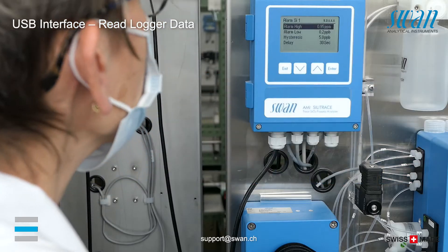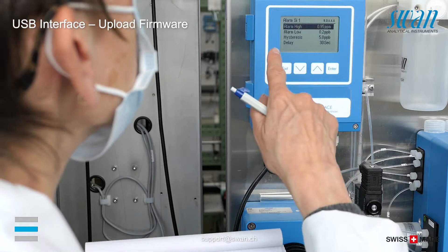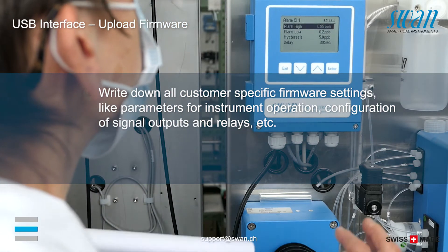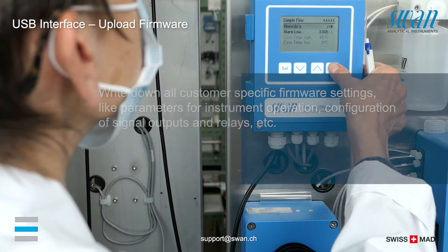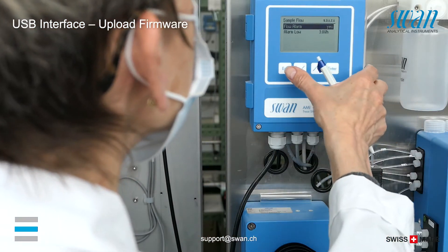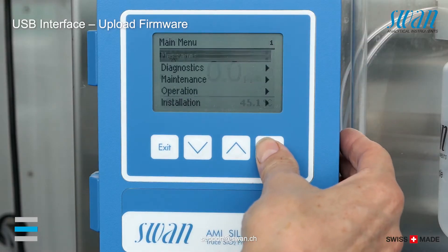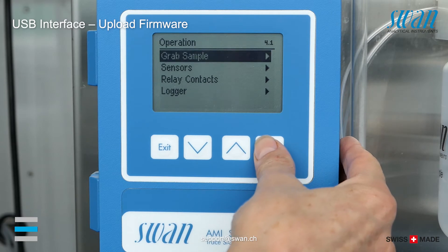To upgrade the firmware from your USB stick, proceed as follows. Eject the USB stick and remove it from the interface.